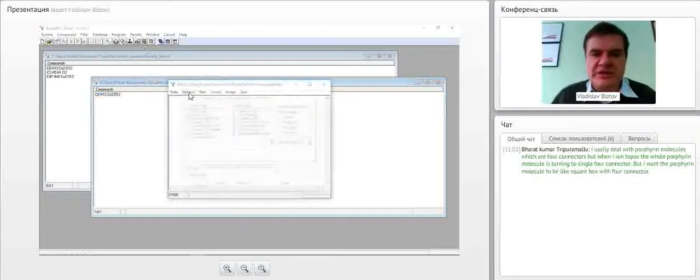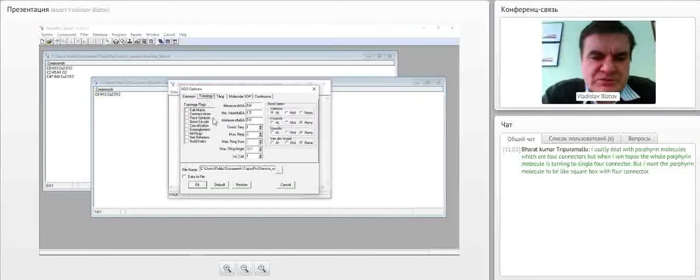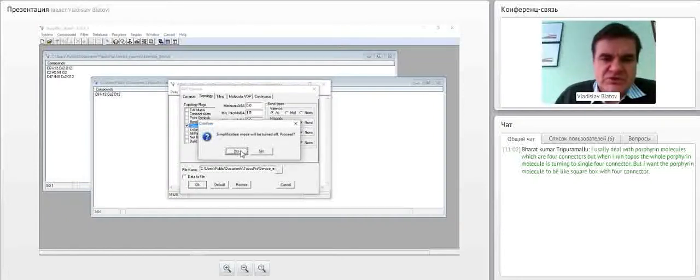So you know that ADS has 2 main modes. The first one is simplification, and the second one is classification. After simplification, we should use the classification mode in most cases. We switch between these two modes, and now we use classification mode.